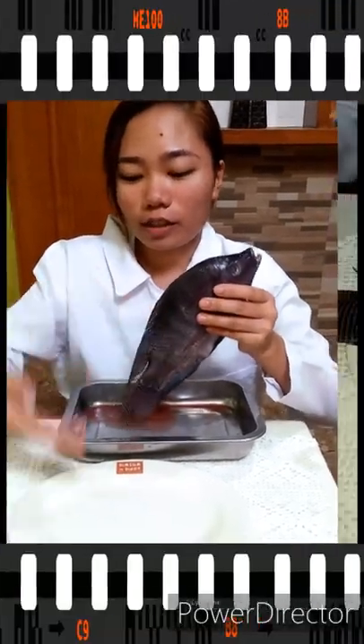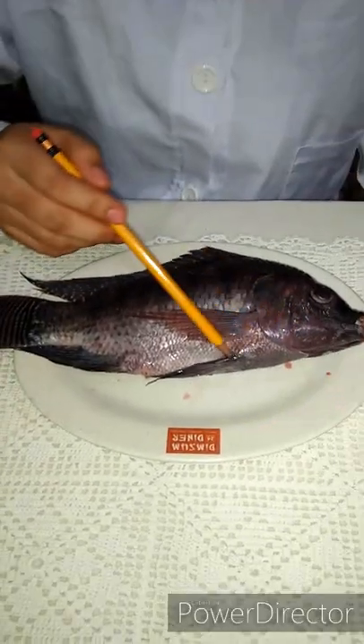Hello everyone, today we're going to dissect this tilapia, which is scientifically known as Oreochromis niloticus. The tools we are going to use today are a pencil, pins, and a blade. Now we are going to transfer this tilapia onto this tray. This is the external parts of the fish.